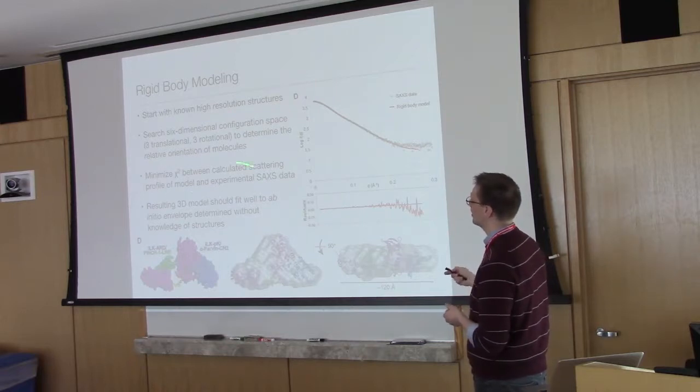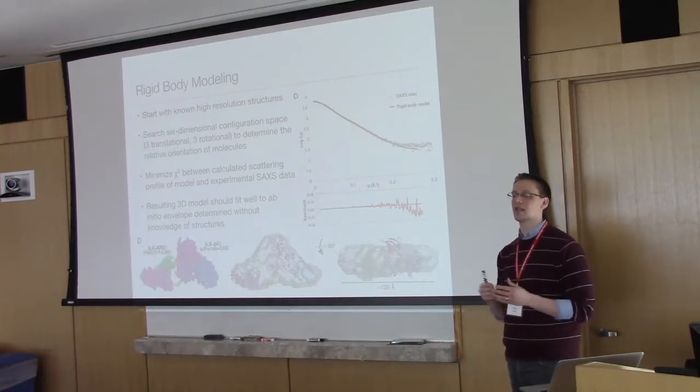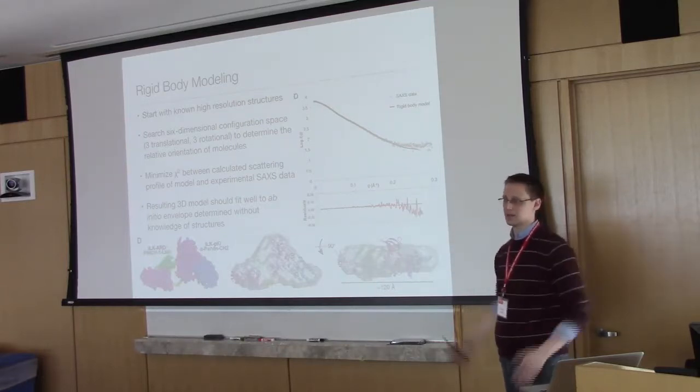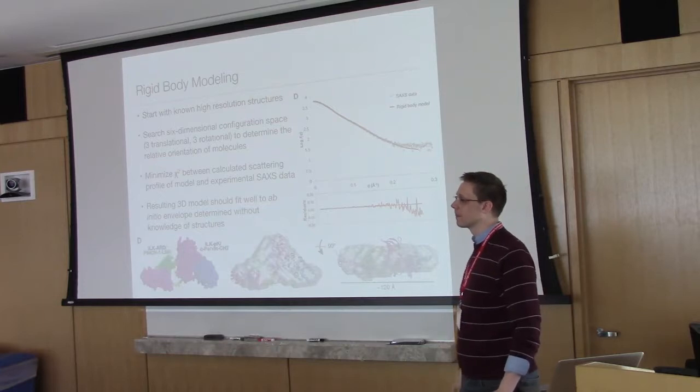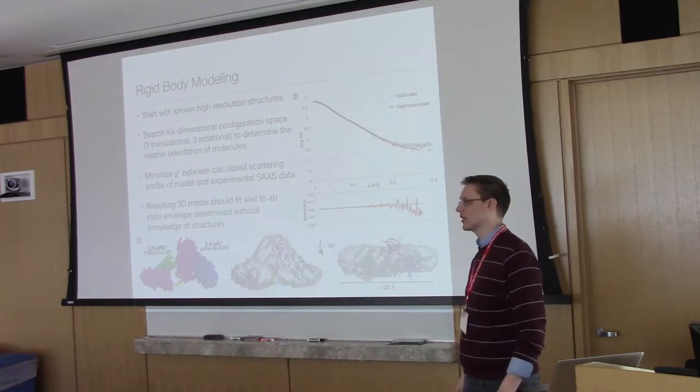And so you're minimizing chi-squared, and again, a lot of times you're using some of these real space restraints, like don't leave it this far apart because that's not useful. So, in terms of chi-square, what's an acceptable number? Yeah, so nobody should ever use chi-squared ever.